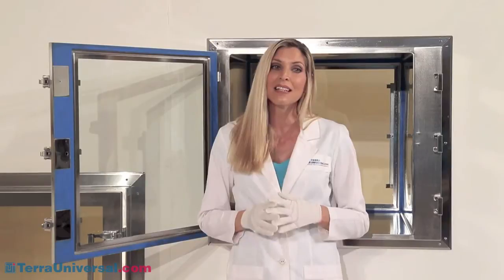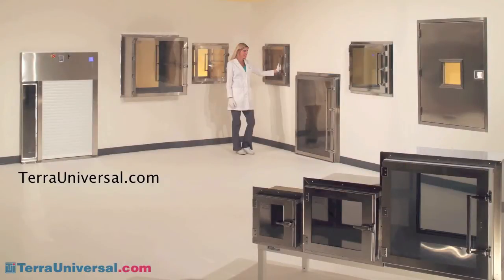This lipless construction supports the chamber's overall easy-clean design and removes clearance obstructions. Trays and other parts slide easily in and out of the chamber.